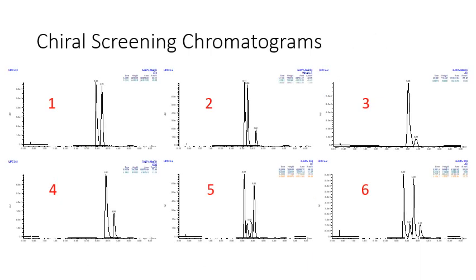When we screen using gradient SFC for chiral stationary phase interaction, you see a variety of conditions that have some phase interaction, but not everything we'd like to see. I'll point out right away that methods 5 and 6, whatever they are here, do produce the peak ratios that we'd expect to see from a full separation of all 4 of the isomers. And we may be able to scale one or either one really of these 2 methods up to give us a one-stage separation, clean separation into all 4 individual isomers that we want. It's not always going to be this simple.